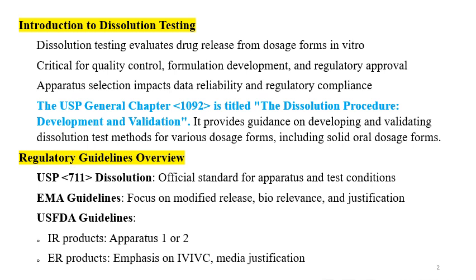Also, dissolution testing provides valuable inputs for the in vivo drug release or dissolution of the formulation, and it also helps for the SUPAC. Apparatus selection impacts data reliability and regulatory compliance. USP General Chapter 1092, titled The Dissolution Procedure, Development and Validation, provides valuable information about criteria for selection of the dissolution testing apparatus.